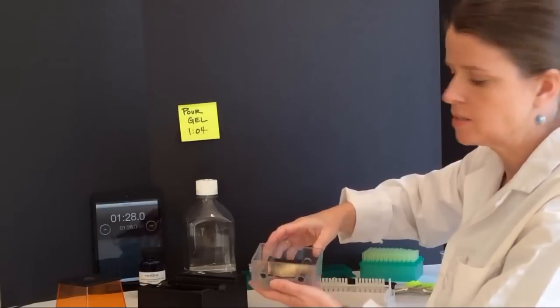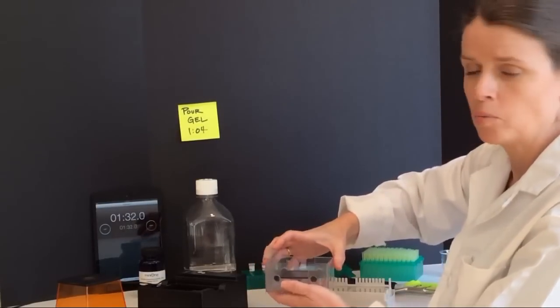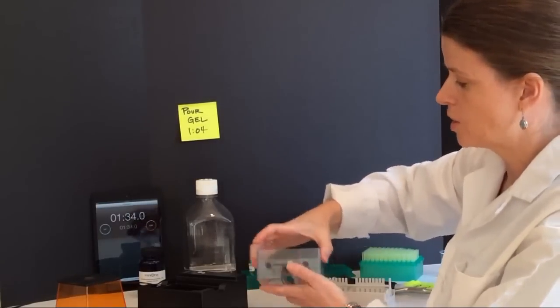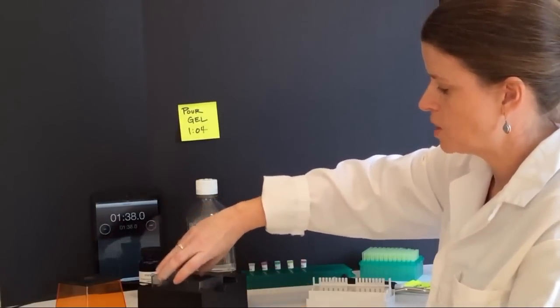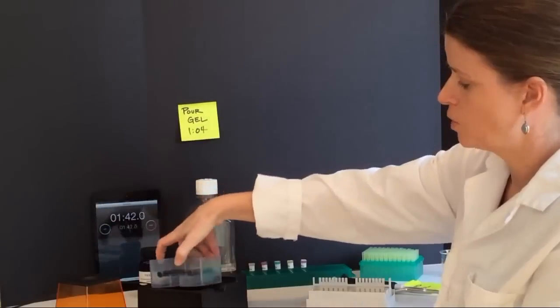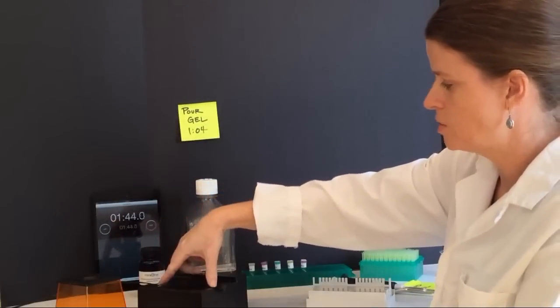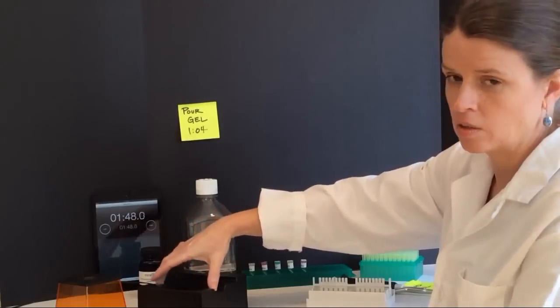This is the gel box. The gel box contains a platform in which to put your gel and the electrodes. You'll notice that if I try to place my gel box into my power supply incorrectly, it won't fit. There's only one right way to put it in. So students can't accidentally set up their gel with the electrodes in the wrong direction.